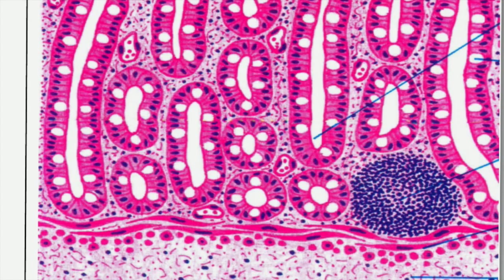This is a diagram showing the part of the wall of the large intestine, starting with the cecum and ascending colon, transverse and descending colon. Cecum and the colon have similar structure. Here you will notice that no villi are present, only crypts. The crypts here are very deep and wide. As regards the lining cells, we have the surface epithelial cells, the enterocytes and goblet cells.